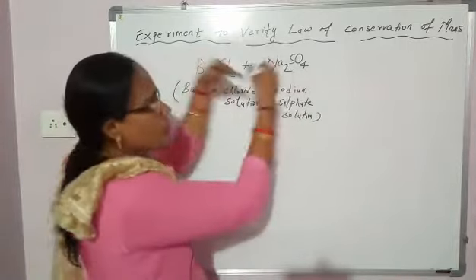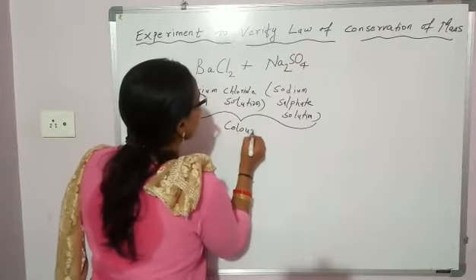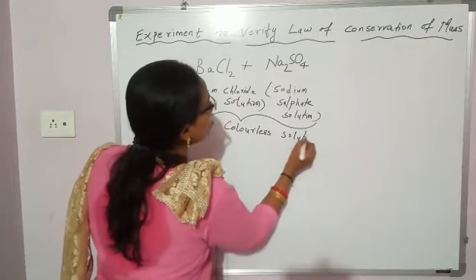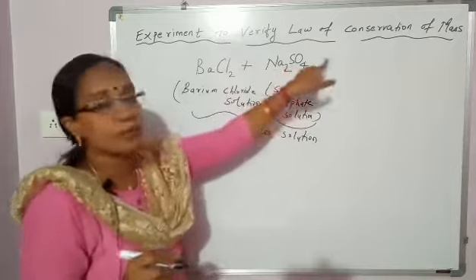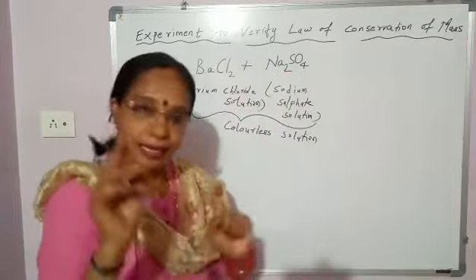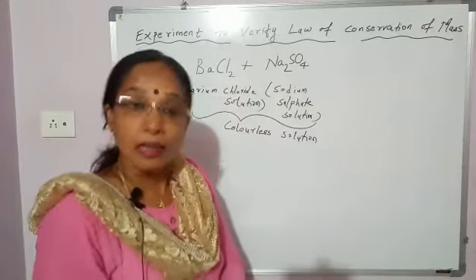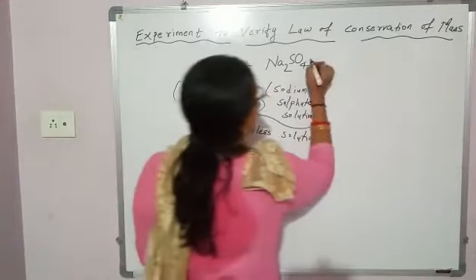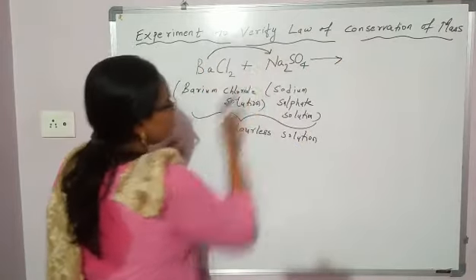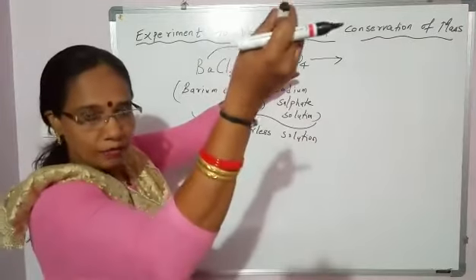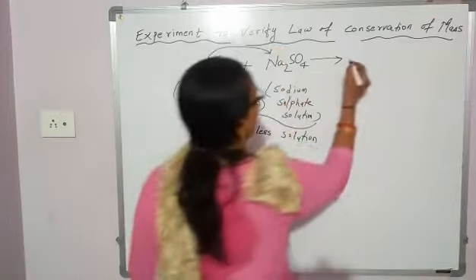So both solutions are mixed. Both the barium chloride solution and sodium sulfate solution are colorless. When you mix them, immediately you get a white precipitate. Barium will take the place of sodium — sodium will be displaced — so barium sulfate, BaSO₄, is formed as the white precipitate.